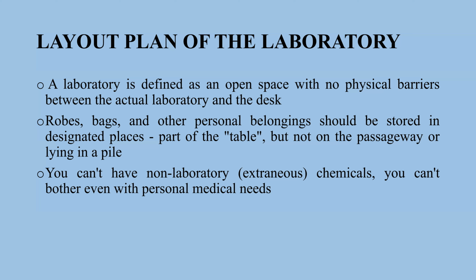Usually we have simple rooms. It will be good if we have canalization, water supply, electricity, of course, and ventilation.